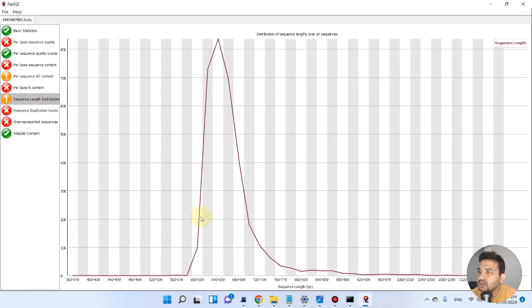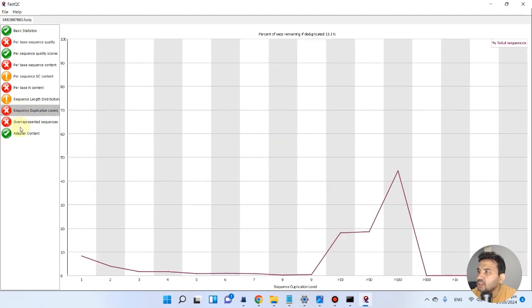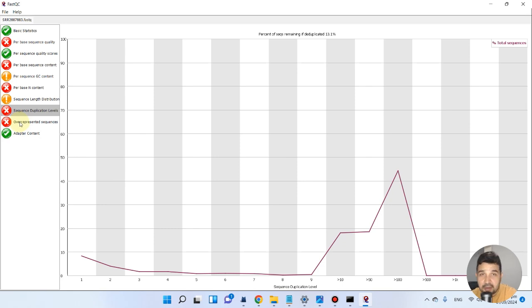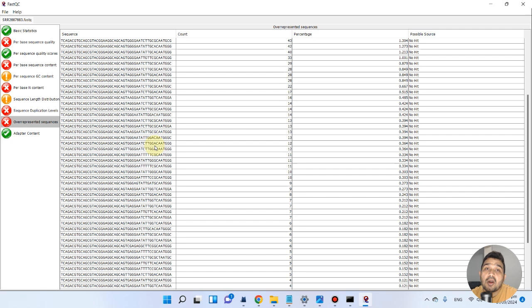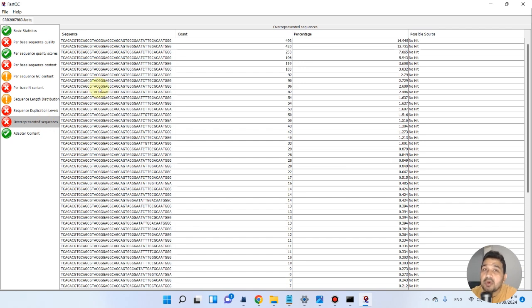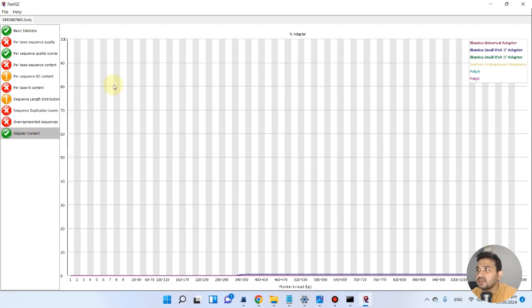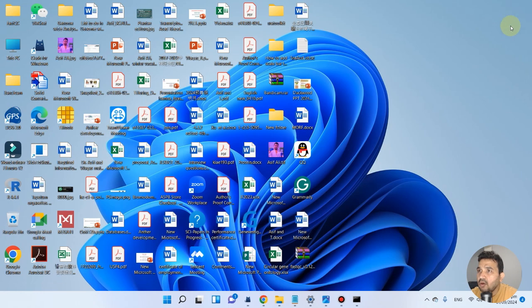The sequence length distribution is okay. However, in the sequence duplication level, there are more than 100x duplication levels, so this cannot be used. There are also many overrepresented sequences — these are sequences that appear at excessive frequency due to sequencer problems or other data issues, and they can skew your downstream analysis. Adapter content is also shown. Overall, this file fails QC and cannot proceed. Let's go back and run the second file.